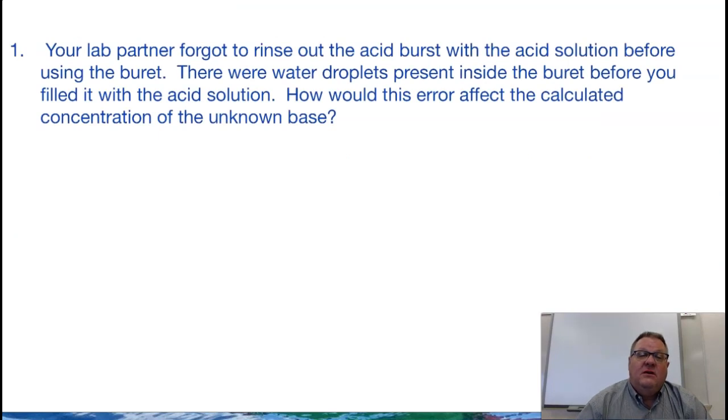They didn't rinse the burette out like I showed you in this video. It was wet, it had water droplets in it, and they just filled it up with acid and went. What I want you to do is tell me if this is an error, and tell me how the final calculated MOH minus would be affected. Okay? Pause the video, come up with an answer, and then bring this back up to play, and I'll share my thoughts with you.